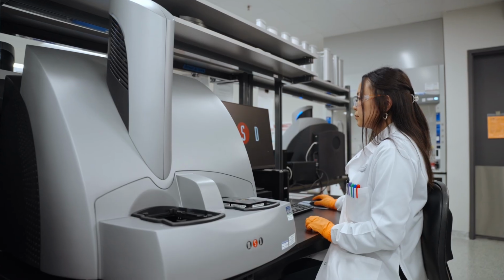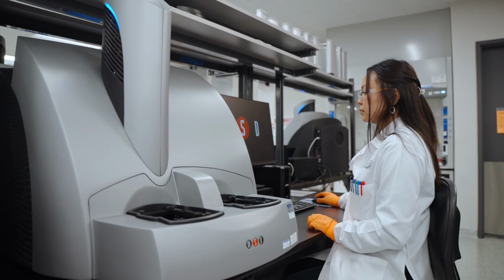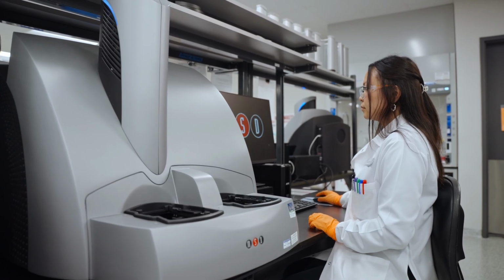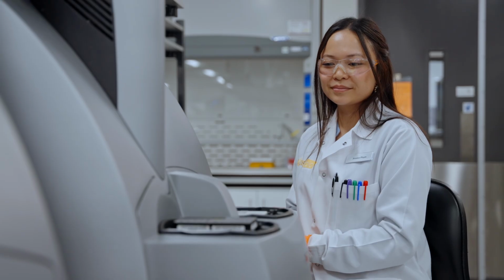One thing that's unique about the MSD is that it's a format that allows for a very easy bridging assay. So what that means is in the context of immunogenicity, we're developing an anti-drug antibody assay. We're trying to understand if the patient is producing immune response that binds to the drug. We establish that by having differential labels on it. So if the antibody is multivalent or bivalent, binds to a capturing antibody, binds to a detection antibody, signal has a relationship with a dose response.